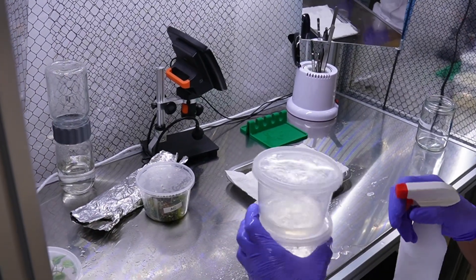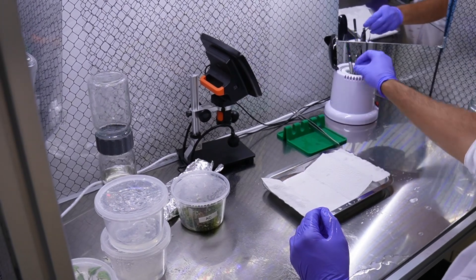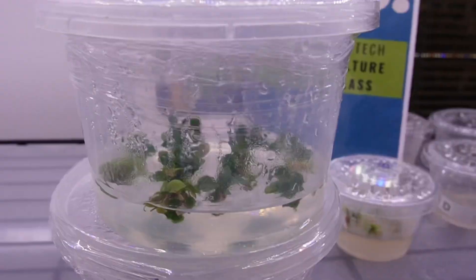In the afternoon of day one, we learned about aseptic technique and practiced subculturing some philodendrons. I tried to sort mine by size — you can see the before and the after.